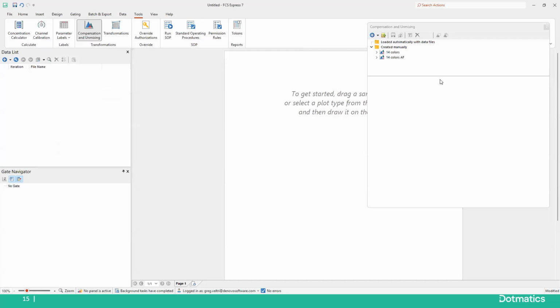All right, so this could have been with cells, this could have been with beads. So you can have multiple matrices on here that allow you to do comparisons, right? That's the nice thing about unmixing, seeing where things are, or maybe you had a different clone and you want to see if that affects it somehow. You can have all of those unmixing matrices sitting right here. So what I'm going to do is bring in a data file.